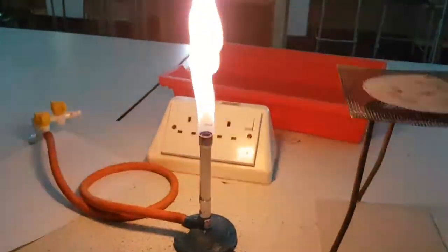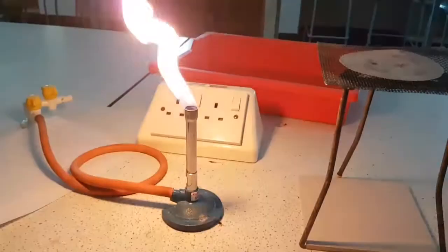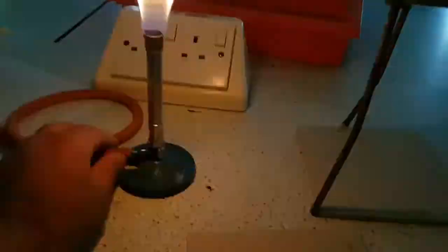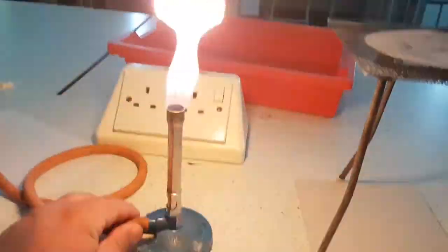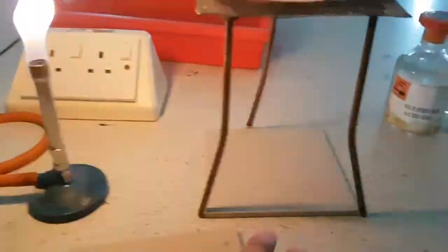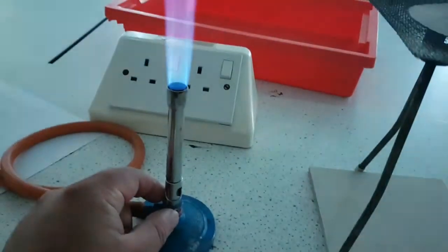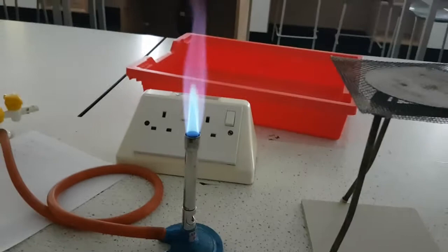I've turned the light off for added effect. As you can see, it's quite a tall flame — this is a safety flame, this is how it should be. You can easily, carefully and safely handle the Bunsen burner from the bottom. Now because we're heating, when you have it on your safety mat and we're going to be heating that solution, you're going to want it on a roaring flame. You should be able to hear that — that's why we call it a roaring flame.